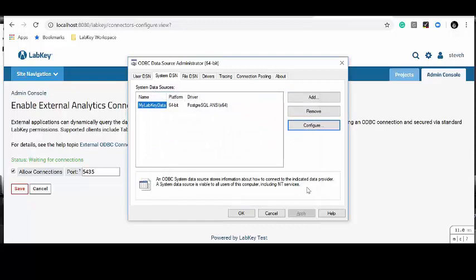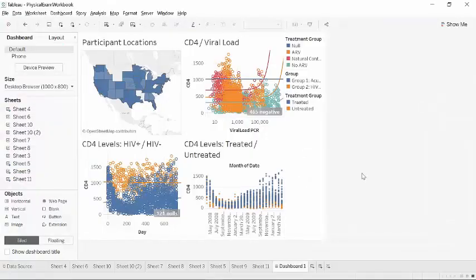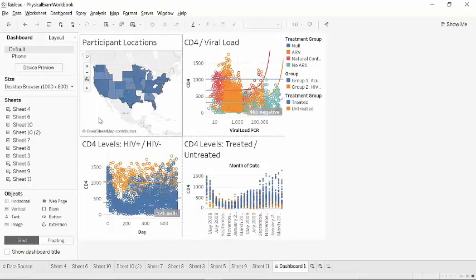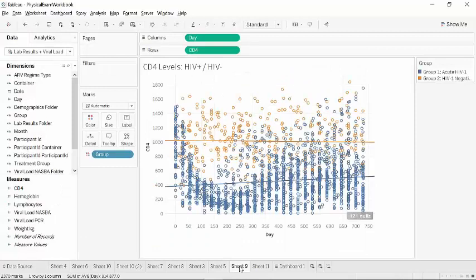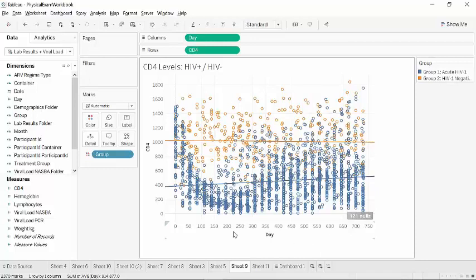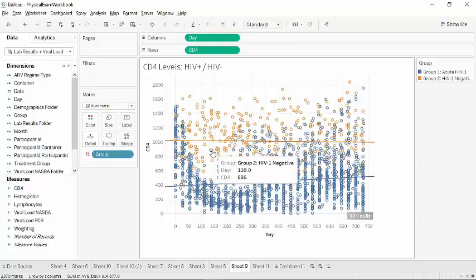Let's take a look at the actual visualizations that I've created — these might be a little more meaningful now with some context. This one is a geographic distribution of the patients that I've enrolled in my study, and this was very easy to do in Tableau. This visualization here is comparing the HIV negative group against the HIV positive group, measuring their CD4 levels over time — over the 750 days of the study. The blue circles indicate HIV positive individuals; they have depressed CD4 levels, as you would expect. The orange circles indicate HIV negative individuals, essentially my control group in the study, and they have normal CD4 levels.